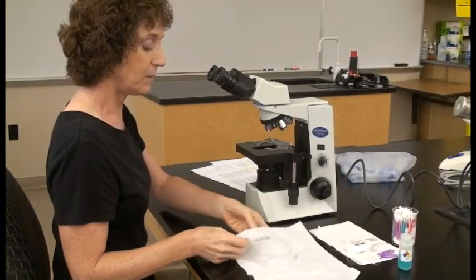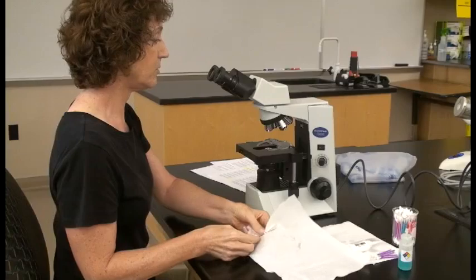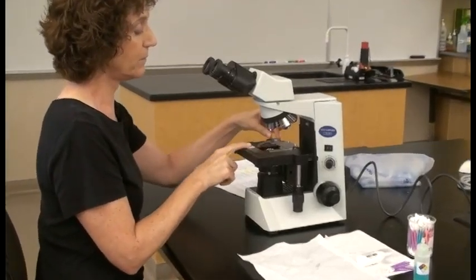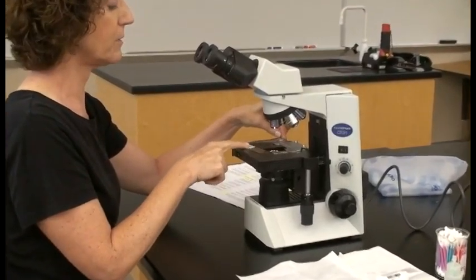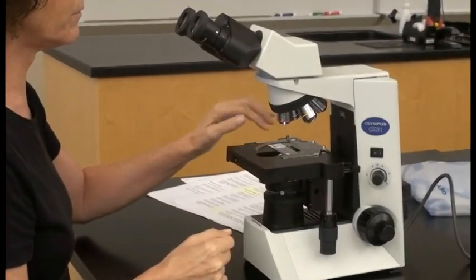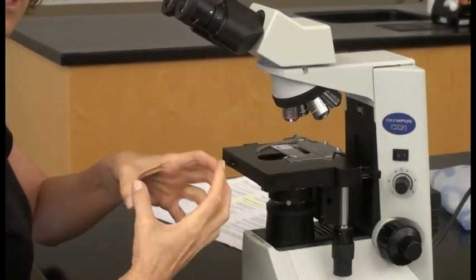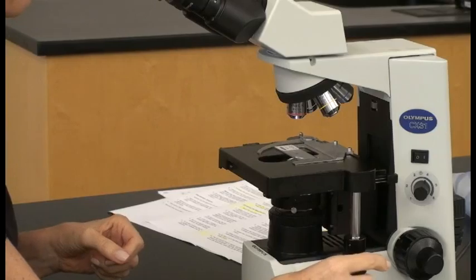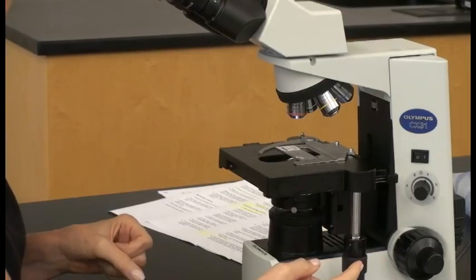We're going to place our slide onto the stage and to keep it in place we're going to use our stage clips. Once the stage clips hold the slide, we can move the slide backwards and left and right using our mechanical stage knob.